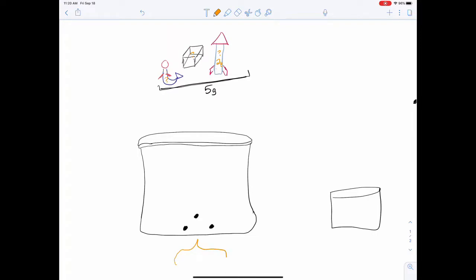You're going to start by heating the beaker that contains the mixture. In lab, you have to be patient and wait several minutes. But as it begins to heat, one of the particles, or actually several of the particles, will begin to leave the beaker. So sometimes they'll go really near to the side of the beaker and they'll get stuck. That's because the higher section of the beaker isn't as hot as the bottom, it's a little bit cooler.